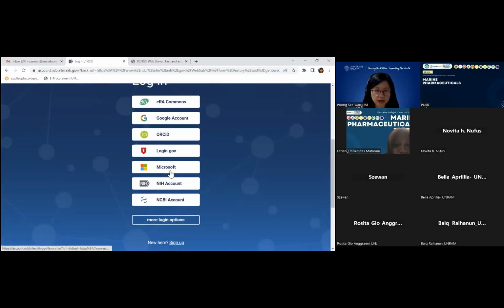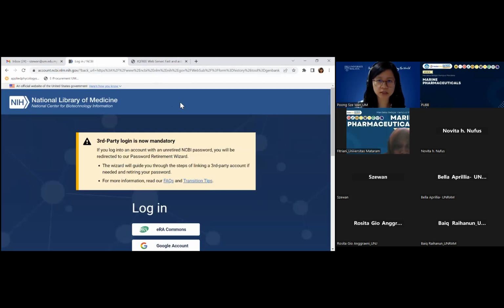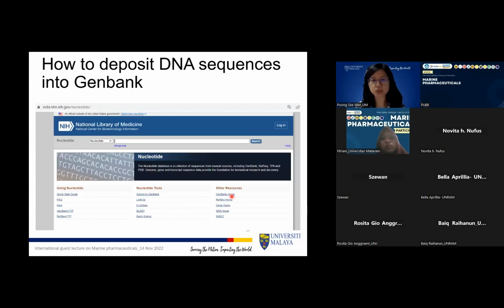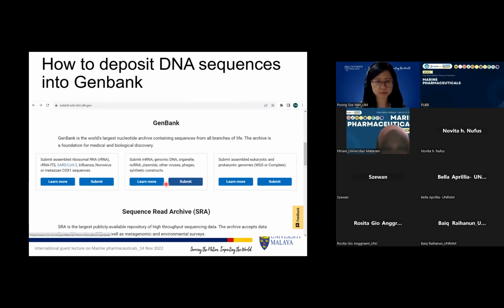I have a login account, but I can't remember it. Never mind, I will show you my PowerPoint. It's easier. So submit to GenBank, right? We're going to use BankIt, this tool.